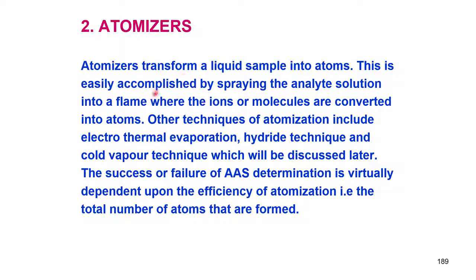So, this is easily accomplished by spraying the analyte. You can look at this slide now. What I have written here: the atomizers transform a liquid sample into atoms. This is easily accomplished by spraying the analyte solution into a flame, where the ions or molecules are converted into atoms. So, is this the only mechanism available to convert a sample into a vapor?